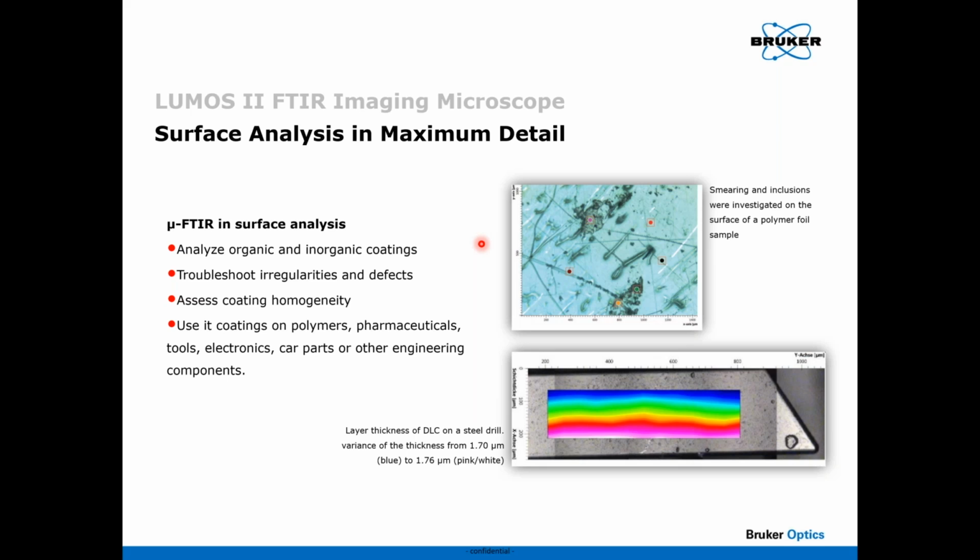And so if we're looking at lubricants on ball bearings and other things, FTIR microscopy works exceedingly well. You'd say, well, ball bearings, those things are round, the surface is not even flat. As it turns out, it's not a problem, because for a microscope, actually the ball bearing is flat for the field of view we're looking at. So this is really a spectacularly good example, and shows that you can tell the difference of a few nanometers actually and characterize that reliably using the microscope.